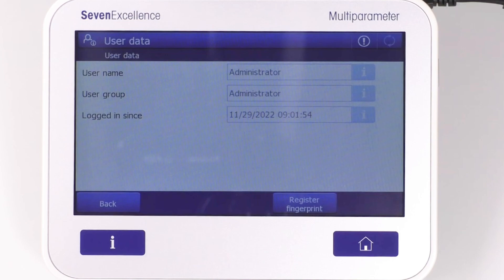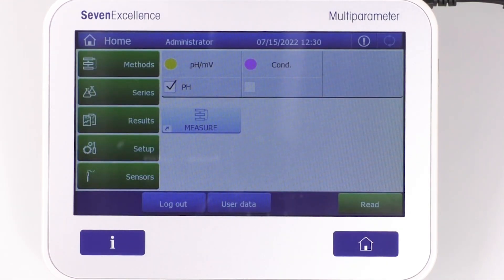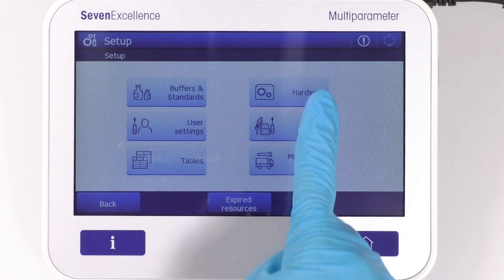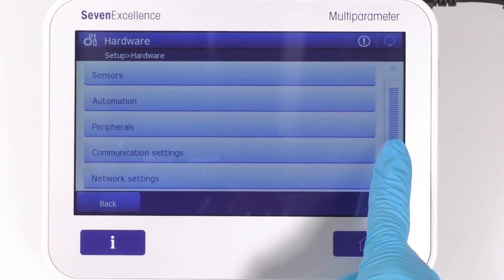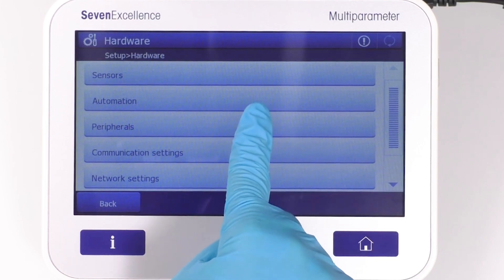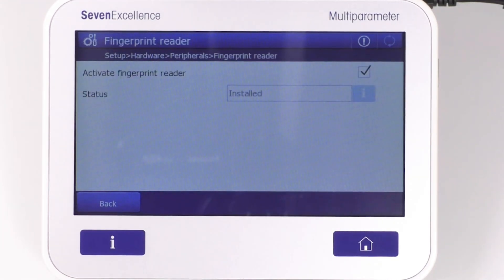It is also possible to register your fingerprint. However, before doing so, let's come back to Setup, then Hardware, then Peripherals, then Fingerprint Reader, to check if the fingerprint reader option is activated.